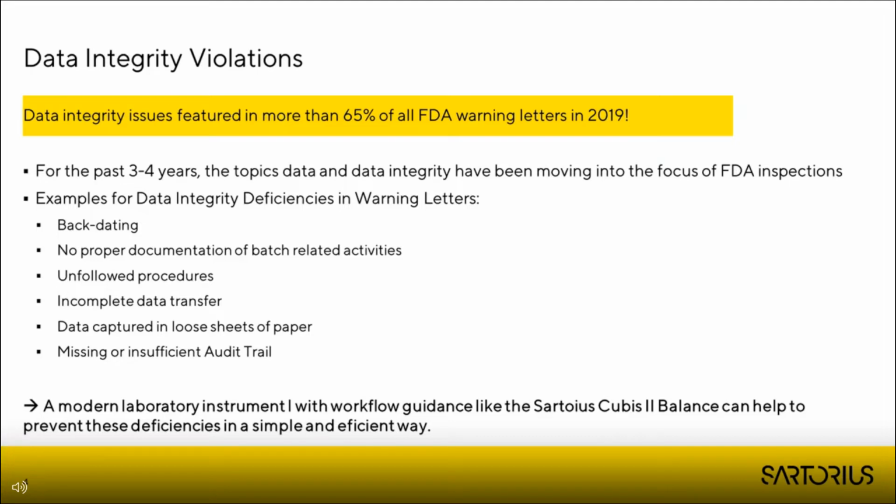Some of them are more related to the instrument itself, for example, not having an audit trail enabled or an insufficient audit trail. The other ones are more related to the documentation process, like not all relevant data was recorded, or the data was not recorded in a way that it's tamper-proof, for example.